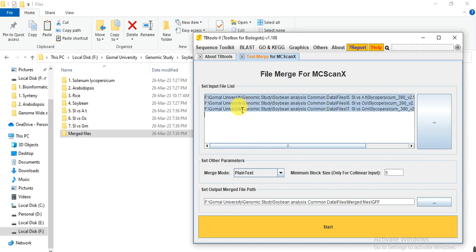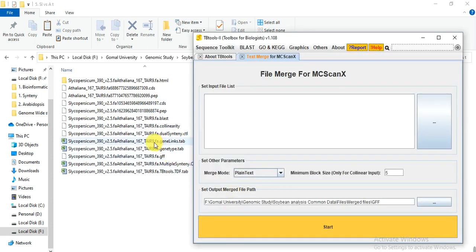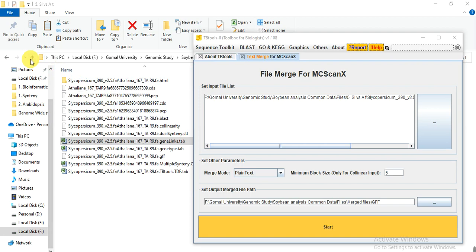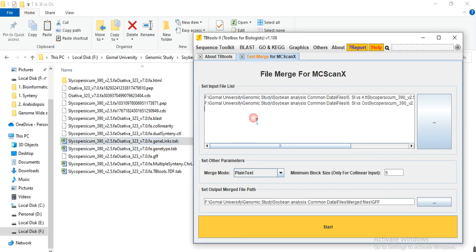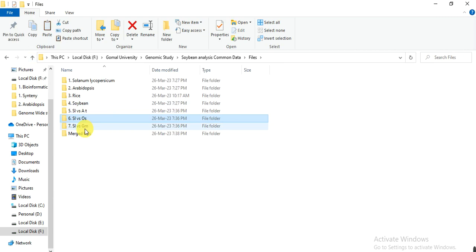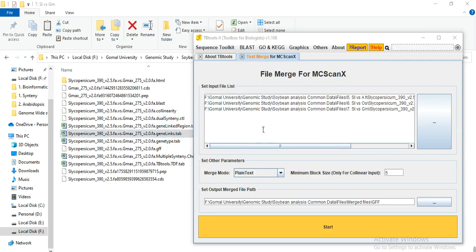Now select all and delete the current inputs. We need another file — the gene link file. There are two types: gene type and gene links. We need the gene links file. Add the gene link file from all the folders, then add the second gene links file, give the output name 'gene links', and click Start. The merging of gene links files is finished.